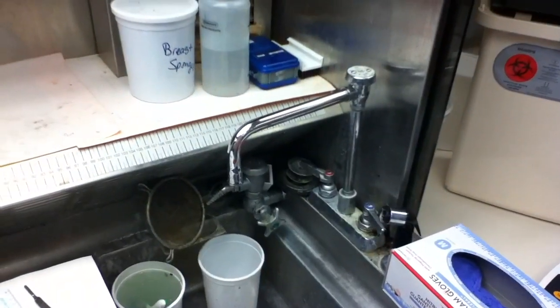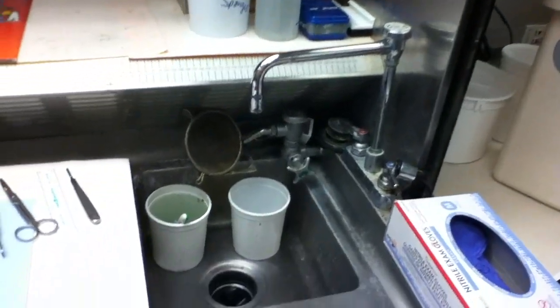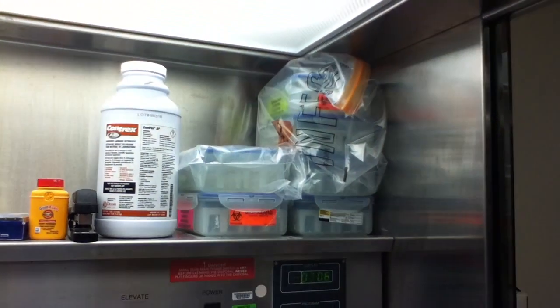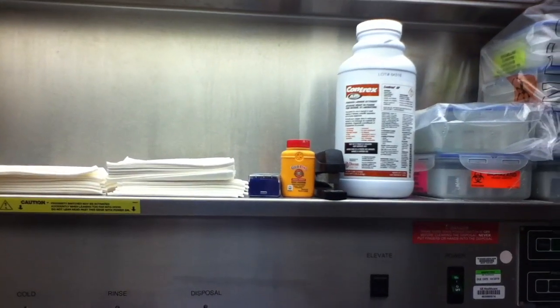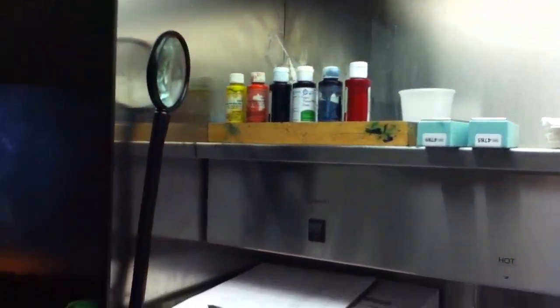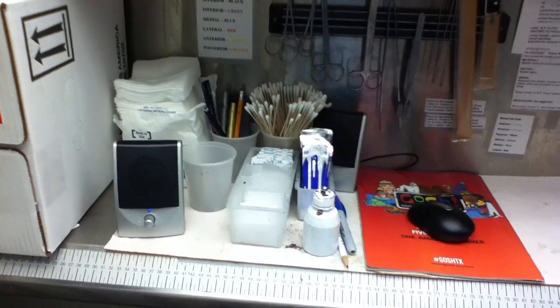The sink has hot and cold, sensor-controlled but you still use the knobs. I've worked at some places that had a foot pedal, which would be nice. It has a little spray attachment for hosing things down. On the side I have napkins, sponges, vinegar spray, racks for blocks, detergent cleaner, powder for sticky gloves, a stapler and staples for closing large bags, white balls, extra blades, inks, a Cuba formalin for topping off small stuff, four-by-fours, Q-tips, and biopsy bags.